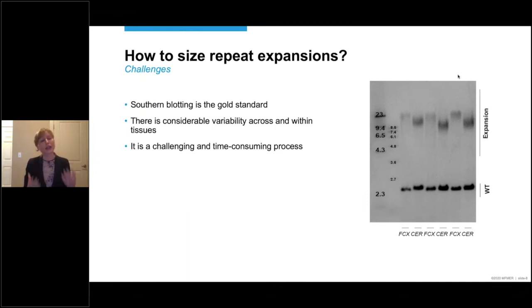And in this case, three individuals are displayed, three unique individuals, two regions each, the frontal cortex and the cerebellum. And as you can see, the expansion size appears to be longer in the frontal cortex than in the cerebellum. And that stresses the fact that there is considerable variability across tissues and within tissues. I should also mention that southern blotting can be challenging and very time-consuming. It generally takes at least a week to do a single southern blot.